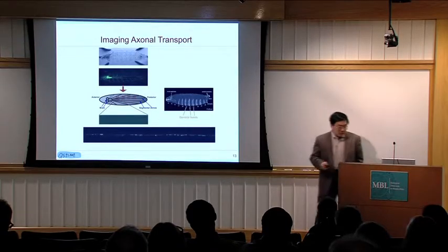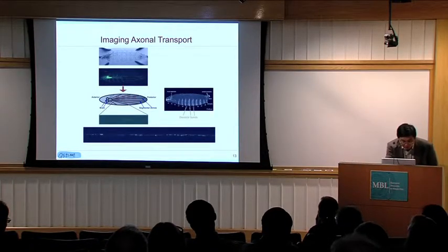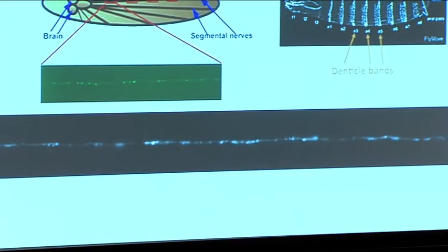So if you put all this together, this is actually similar to what I showed you before. You can see the transport process is a very busy process. Some of the cargoes are going this way, the others going this way.